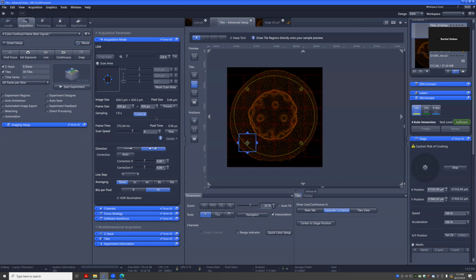There's a point where 2 pixels next to each other are not going to see any difference, because we're hitting literally the limit of physics, being able to get that light through a lens and then seeing 2 different spots. So really the resolution doesn't tie to any of the tiling. It's really how many pixels in one field of view we can resolve with this objective at this wavelength.